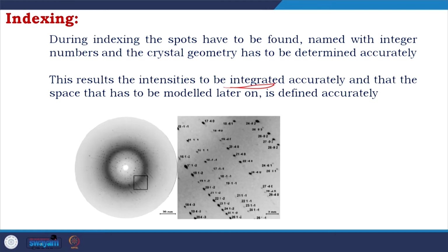So, this is the diffraction pattern we have shown before, and remember I talked about how, for getting a good diffraction, your crystal ordering would be perfect.